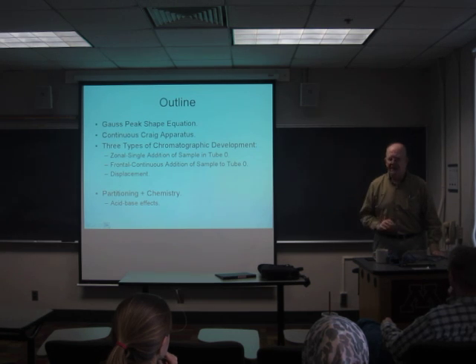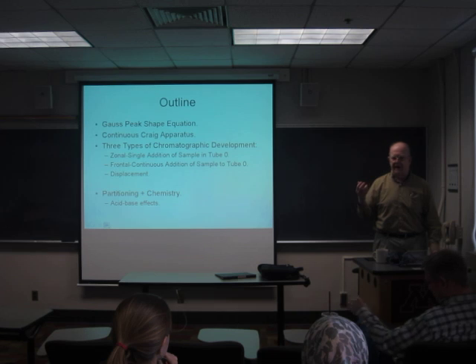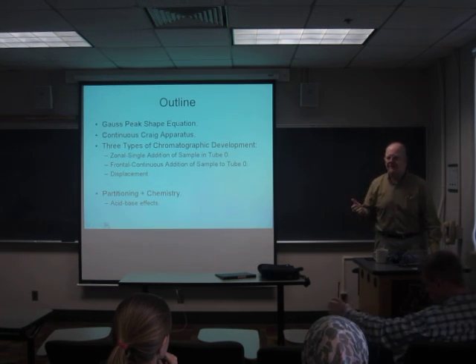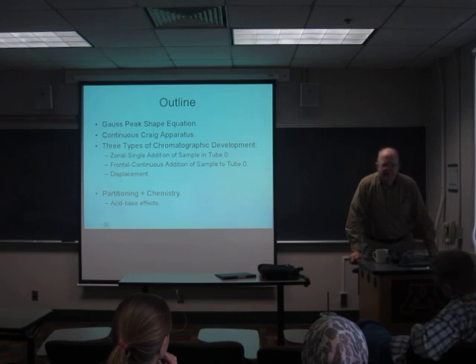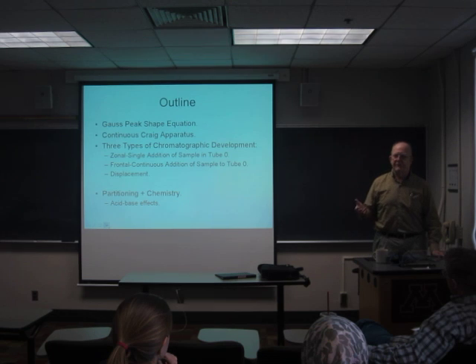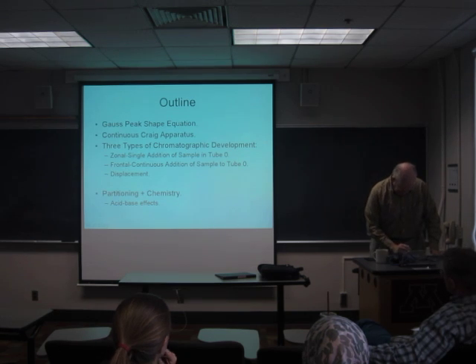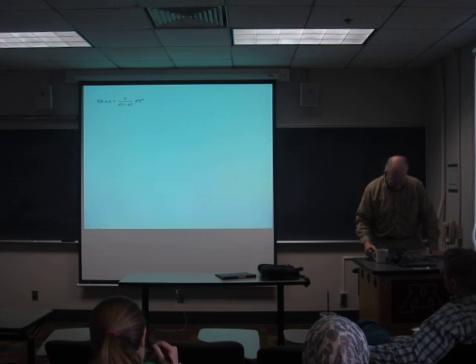This is especially important when you have an aqueous mobile phase, because lots and lots of things ionize in water. It's especially important in biological separations because the vast majority of the compounds that you're separating in biological operations have functional groups which can be protonated, which can ionize, and so on and so forth. So we need to understand that.